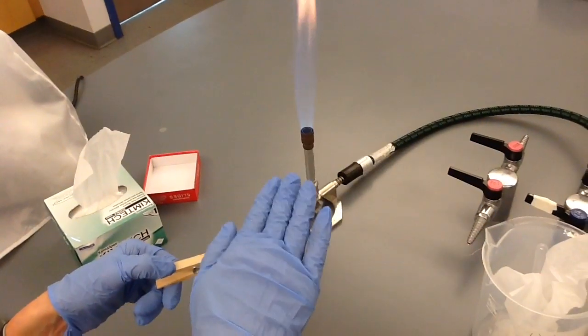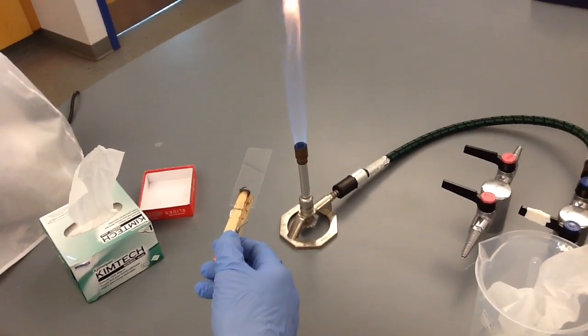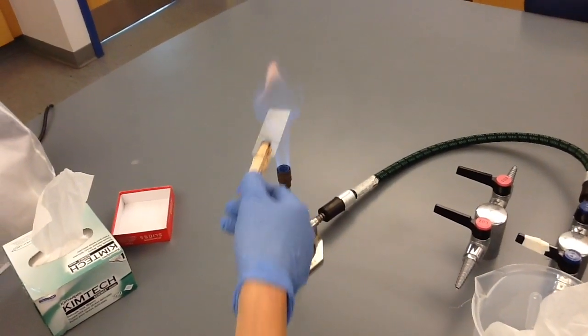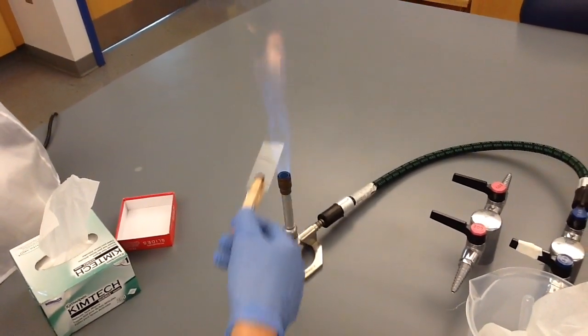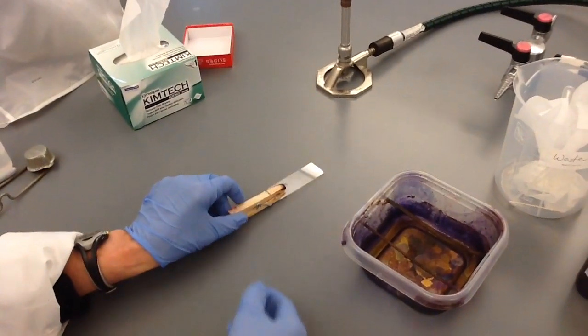The cells are on the top. You heat fix by passing back and forth through the flame two or three times relatively quickly. One, two, and three. That slide is very hot now so you set it down on the bench to cool for a few minutes.